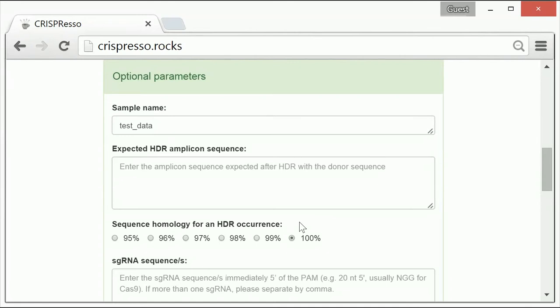This option allows for optimal analysis due to technical artifacts present in the sequencing data, such as sequencing errors or single nucleotide polymorphisms, or SNPs, in the cells used in the experiment.